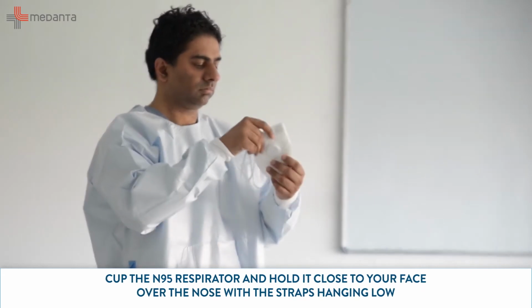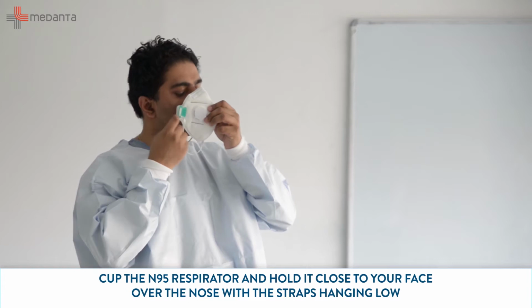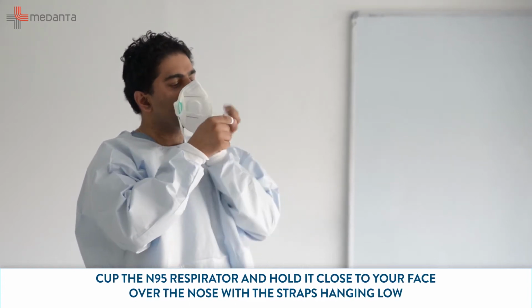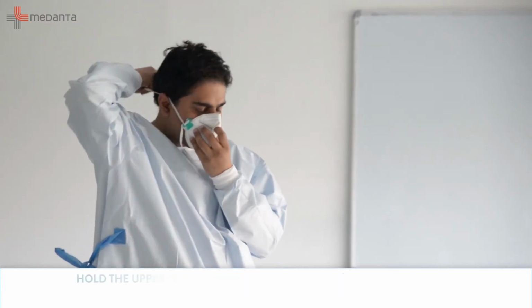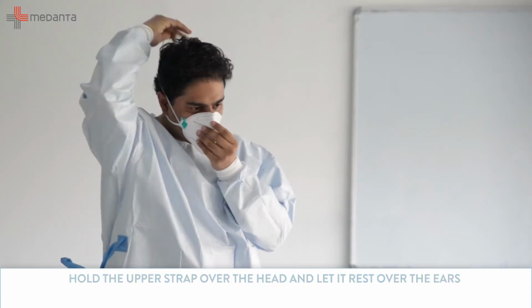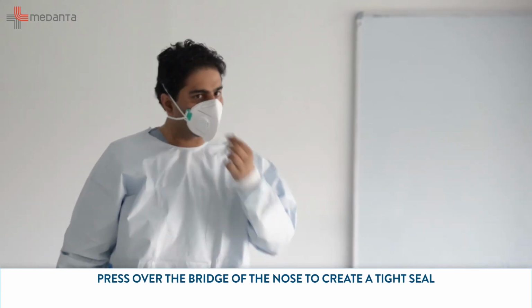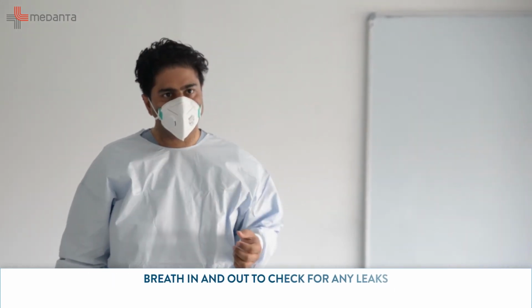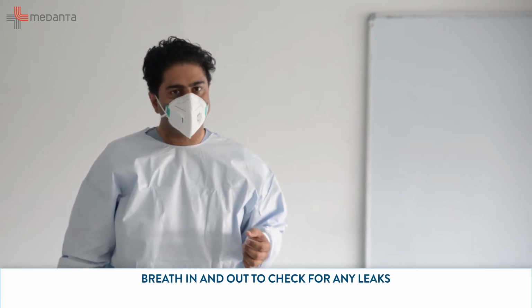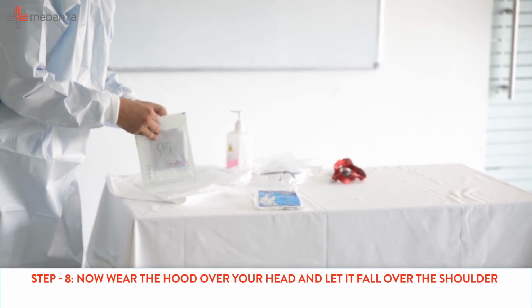Cup the N95 respirator and hold it close to your face over the nose with the straps hanging low. Then hold the upper strap over the head and let it rest over the ears. Press over the bridge of the nose to create a tight seal. Breathe in and out to check for any leaks. Step 8. Now wear the hood over your head.